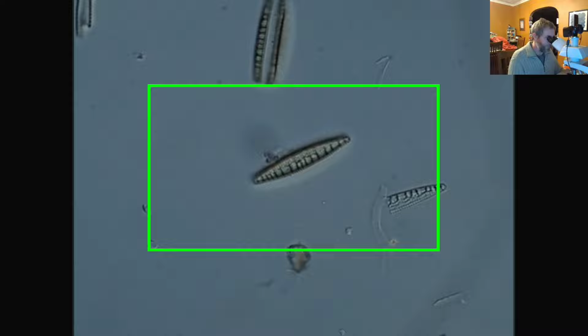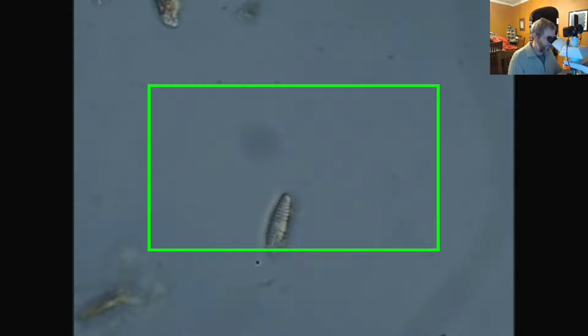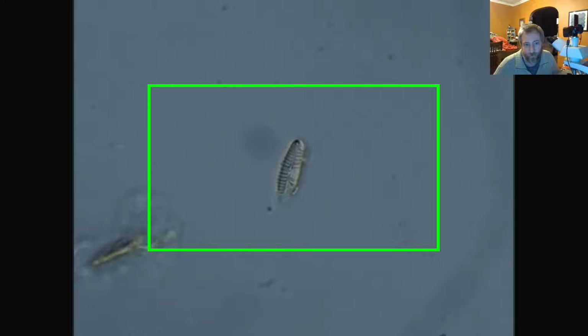Very useful tool for us as somebody who studies diatoms. I want to be able to see all of the structure. On the stream, I was talking about how I knew from some of the diatoms we were seeing that it must have come from flowing water, even though at the time we were streaming, I didn't actually know what the sample was collected from.